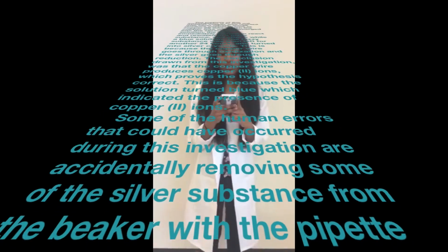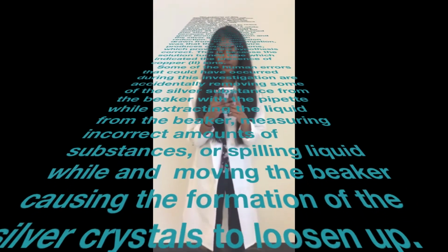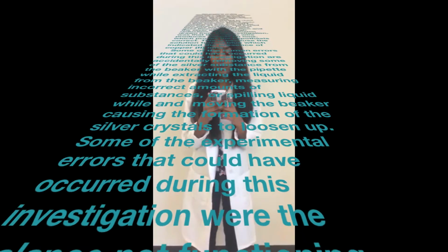Some of the human errors that could have occurred during this investigation are accidentally removing some of the silver substance from the beaker with a pipette while extracting the liquid from the beaker, measuring incorrect amounts of substances, or spilling liquid while removing the beaker, causing the formation of silver crystals to loosen up.